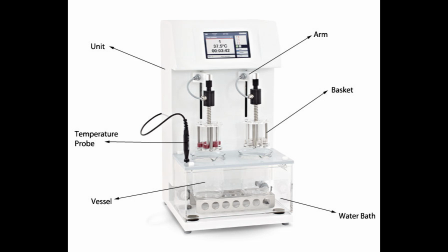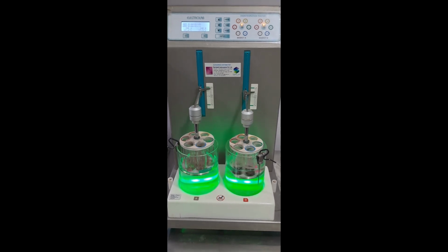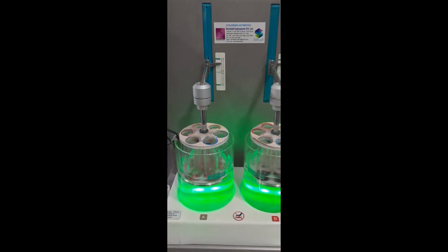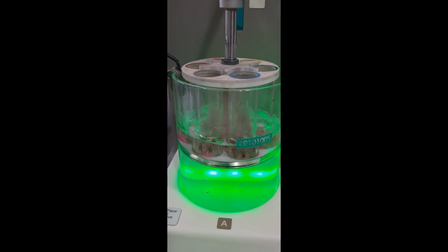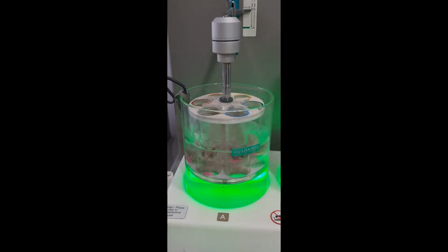Today we will discuss the disintegration test apparatus: definition, principle, uses, evolution, guidelines and much more in detail. Disintegration test definition. A disintegration test assesses how quickly a tablet or capsule breaks down into smaller particles when immersed in a liquid, simulating the conditions in the body.